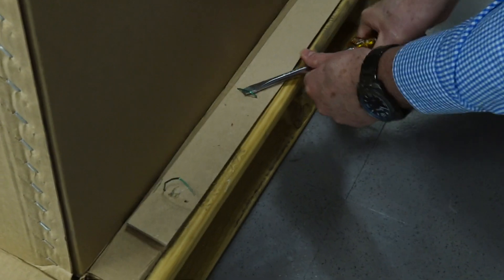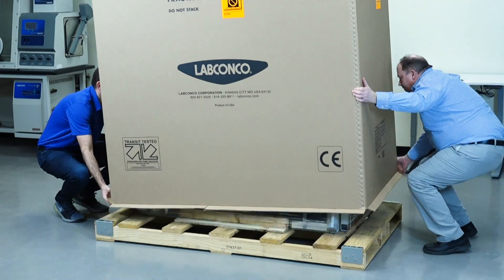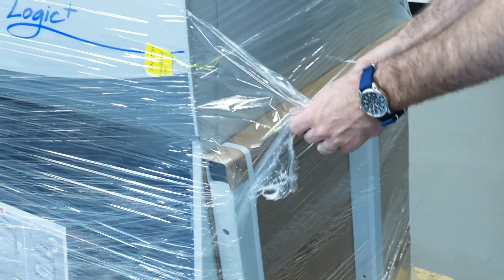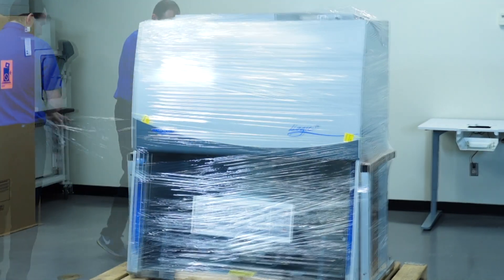Begin by removing the cardboard box from the Biosafety Cabinet. Once unboxed, inspect for any shipping damage. If any damage has occurred in shipping, contact the freight carrier.